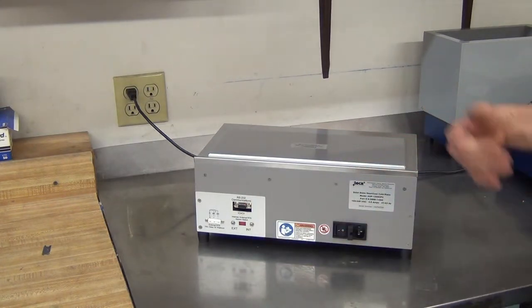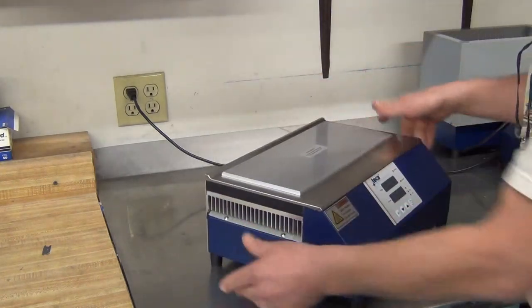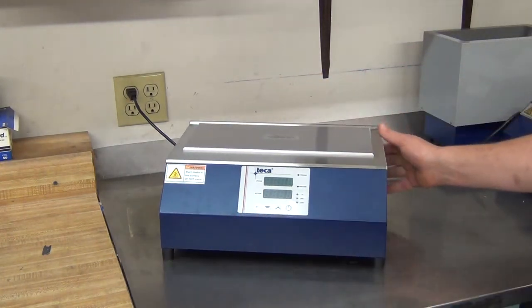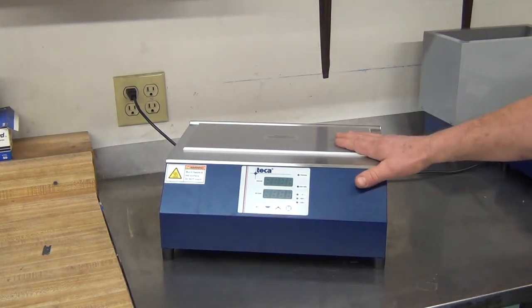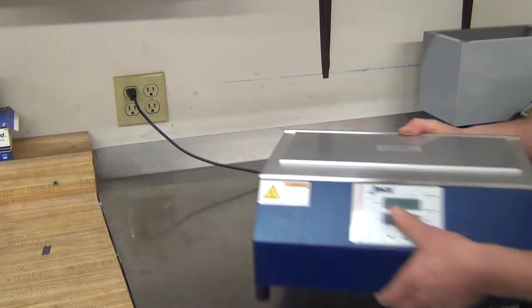Also RS232 communications and software come with it along with poor boys data logging. So there you have the smooth surface AHP 1200 CPV.